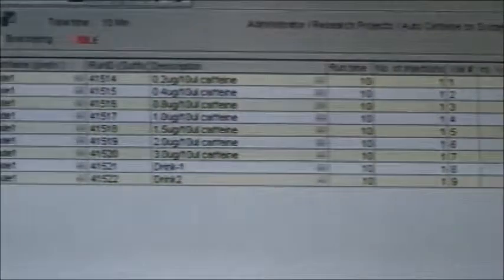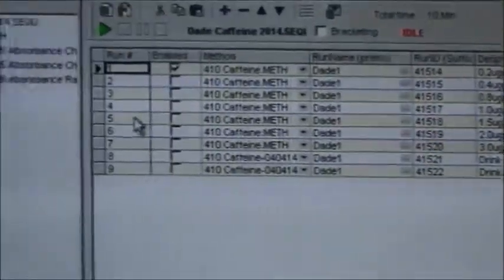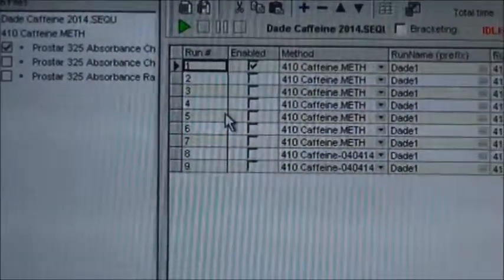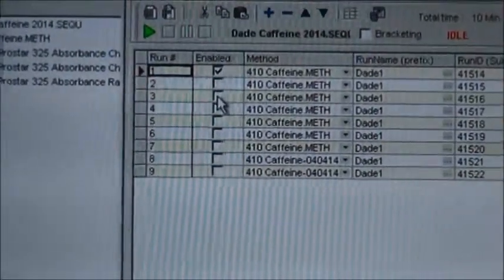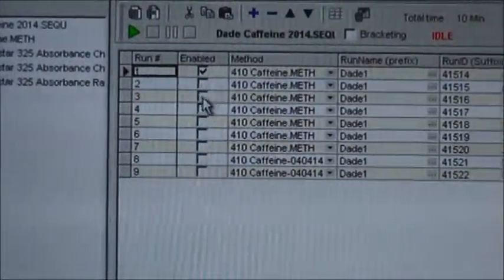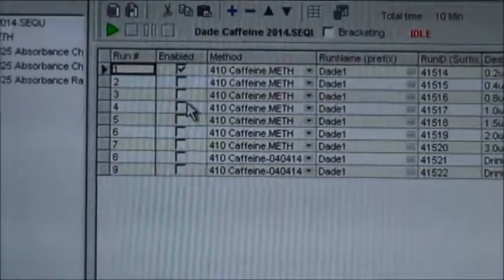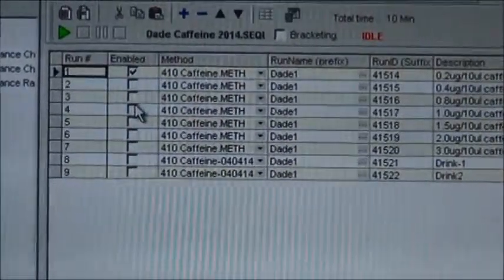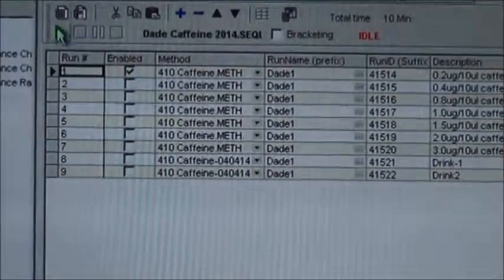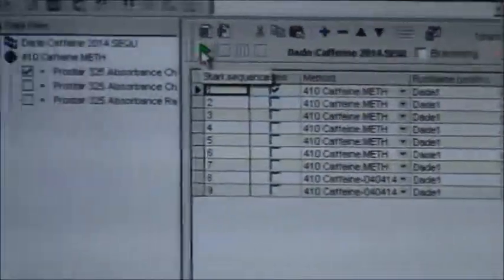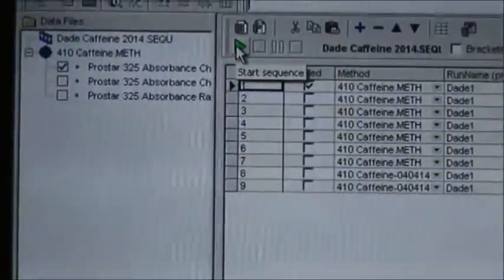Now I've got my method file, I've got my sequence file, and I'm ready to run. I click on this run button to start.